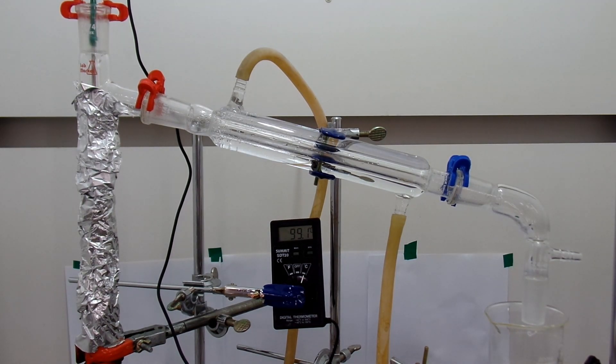So after 2 failures, I just stopped working on the reaction because in my opinion, benzaldehyde is such a disgusting organic compound to work with.